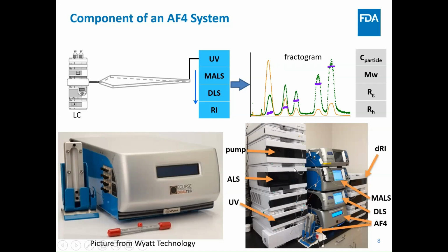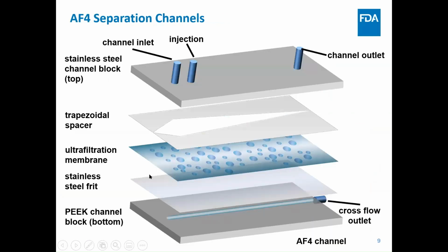You can see it actually uses the Agilent HPLC system, and the main difference compared to traditional LC is the separation channel and the flow control module.